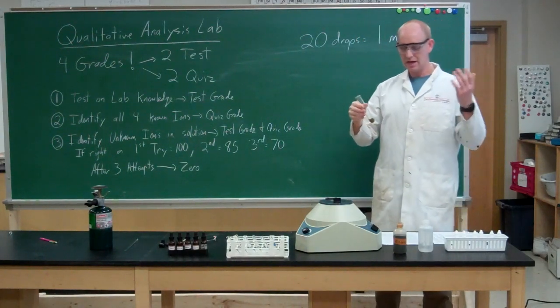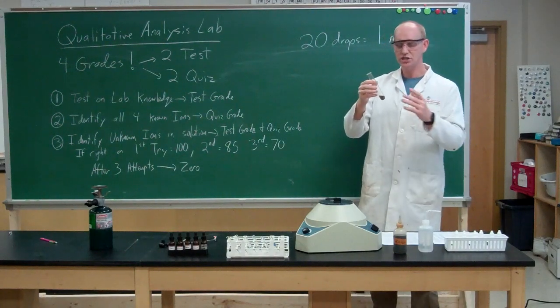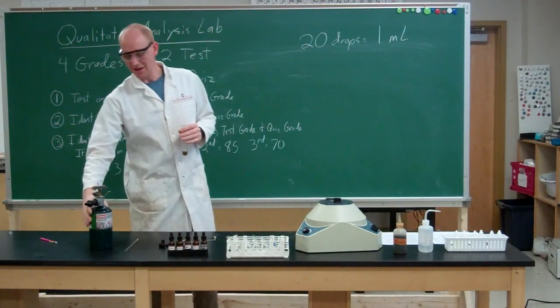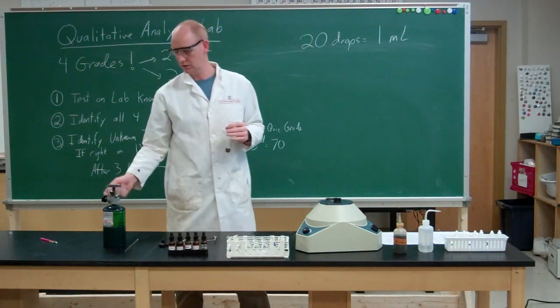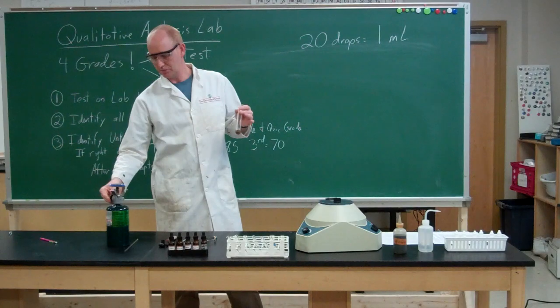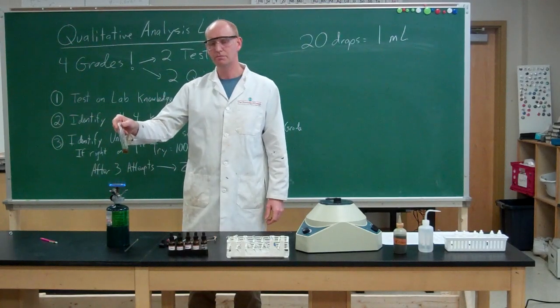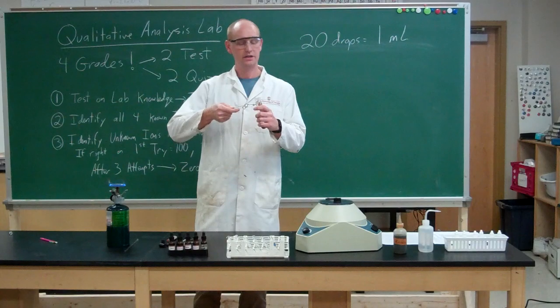Now, what we have to do is add our stock solution, our reagent, to this, and then basically give it some activation energy. So we're going to give it some activation energy by heating it. Now, I'm going to heat it on this burner here. You're going to use regular Bunsen burners in the lab, but I don't have gas in here. Now, you do not want to just stick this right over the burner. You'll burn yourself. So you're going to use a test tube holder.